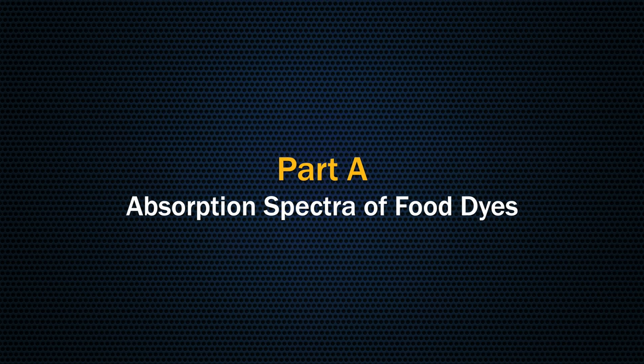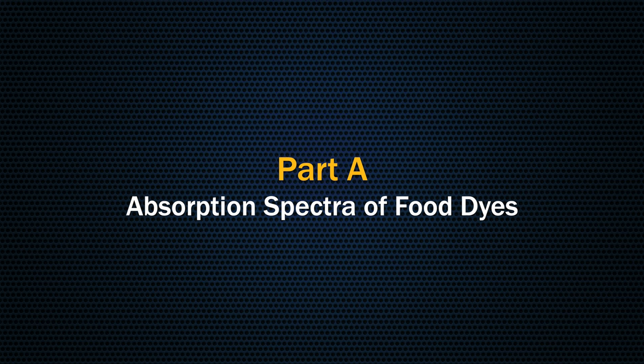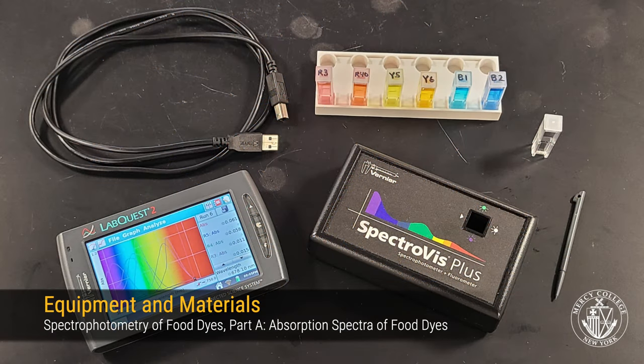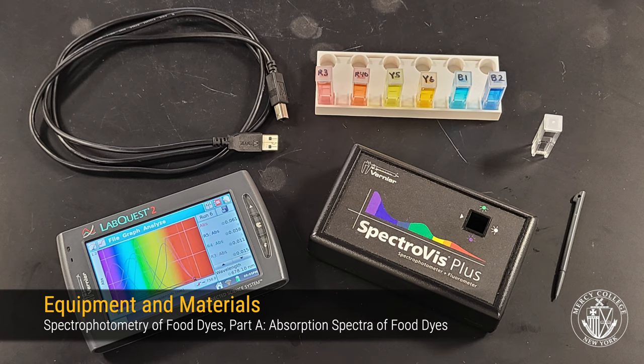In part A of this experiment, we'll collect and analyze the visible absorption spectra of six food dyes. Here are some of the materials that we'll make use of in part A of this experiment.